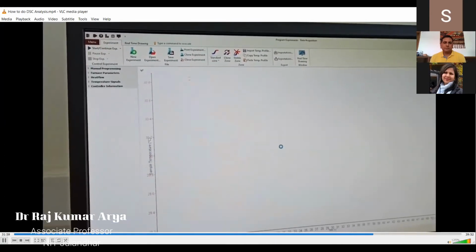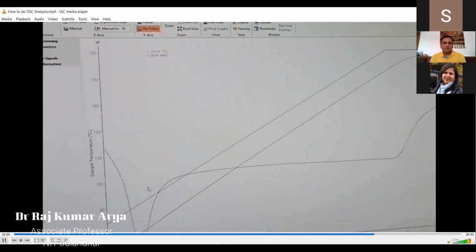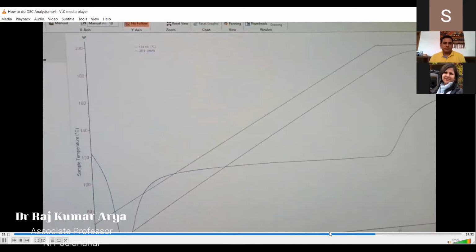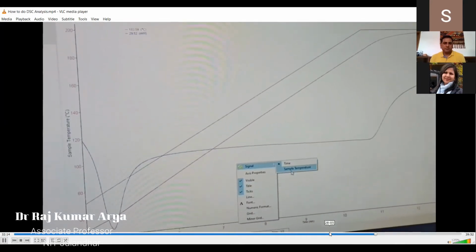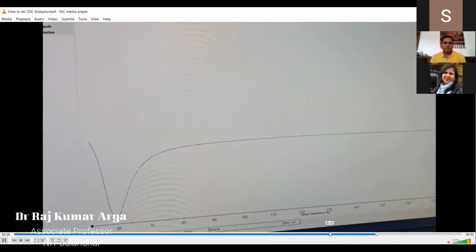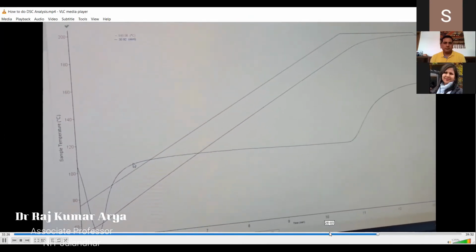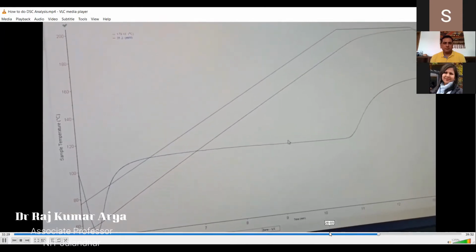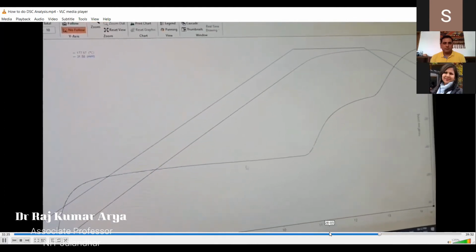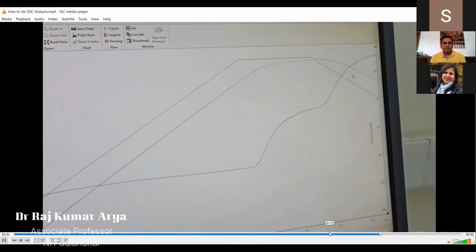We can run the sample again and see. You can see the graph in that case shows the fastest change. You can see the TG; you can change the axis here from time to temperature. It is somewhere around 57 again. Now on the graph side, this part is your heating zone, and you are heating up to 200-something. After that there is the cooling part. In this particular software, the cooling part shows to the upside. From here the cooling starts, and this is the cooling curve.